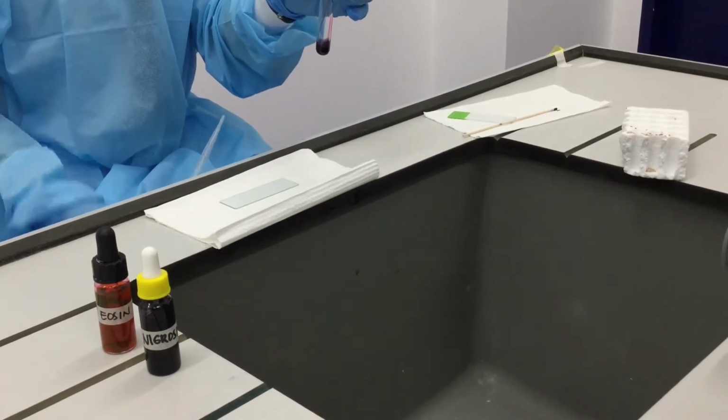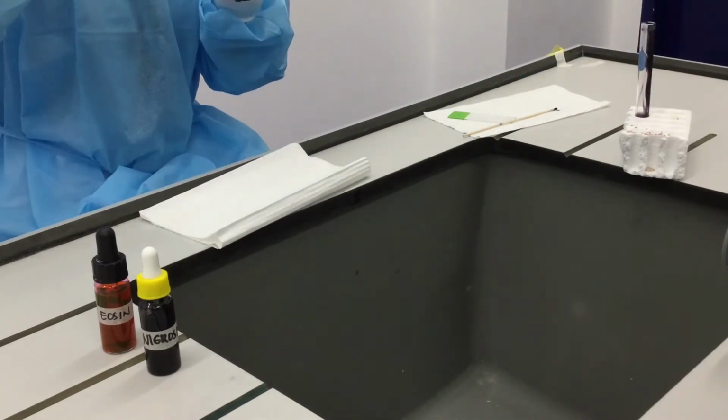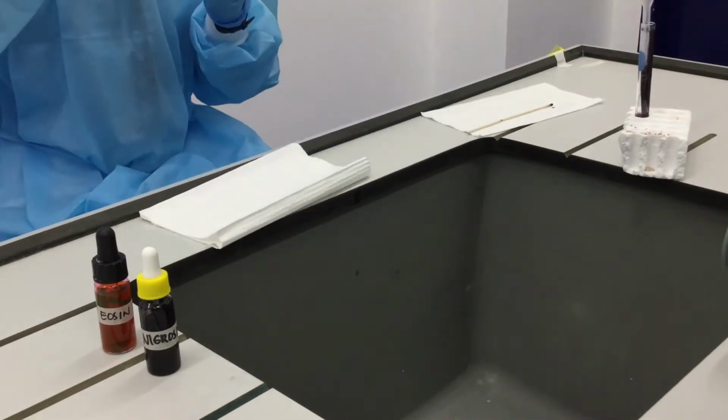Once the sample solution is ready, place 1 drop of sample onto a slide and use a spreader slide to make a smear.